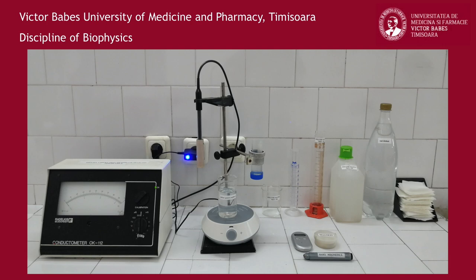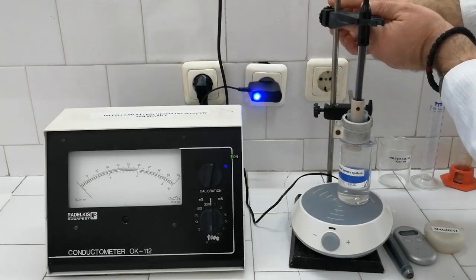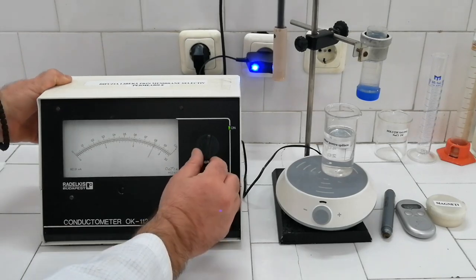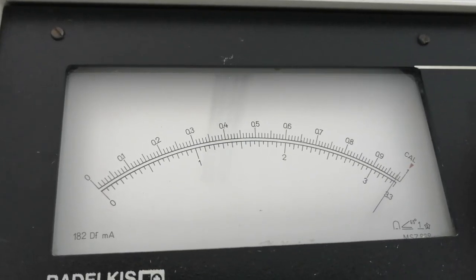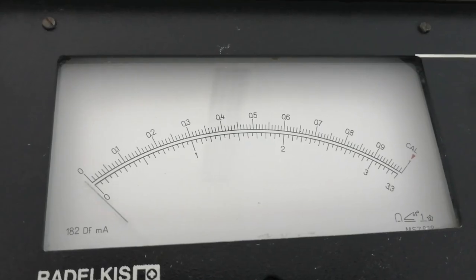Use the following steps to calibrate the conductometer. Set the measuring range button to the 1000 millisiemens position. Place the measuring electrode in air. Press and hold down the button on the back panel of the conductometer. While pressed, rotate the calibration button until the indicator overlaps with the red triangle mark on the display. Release the button on the back panel. The indicator should move back to its initial position.